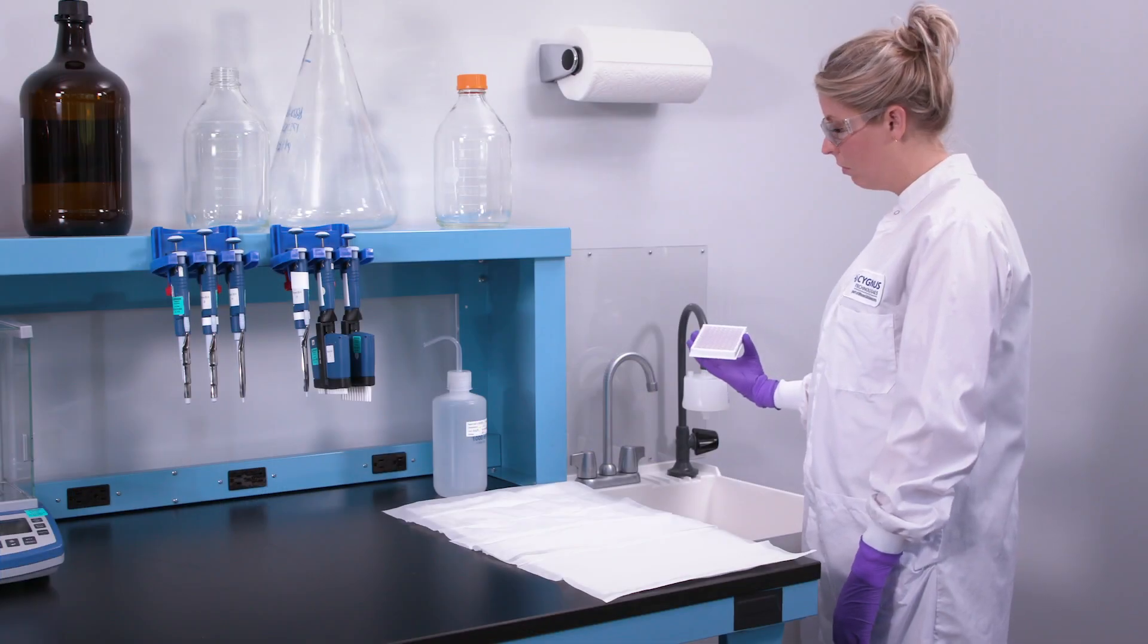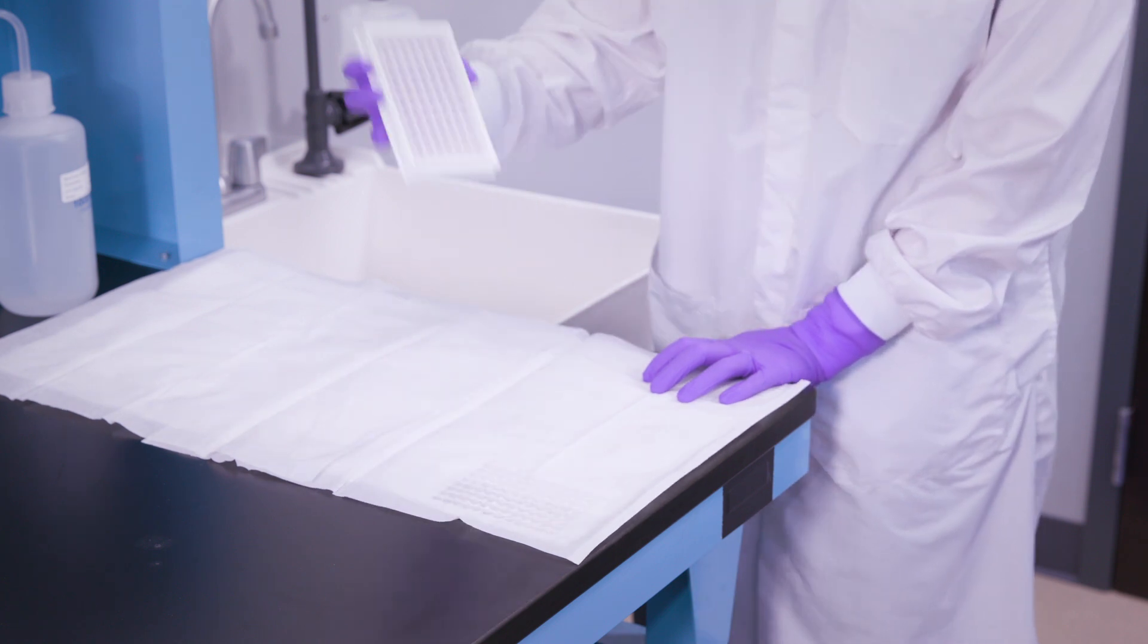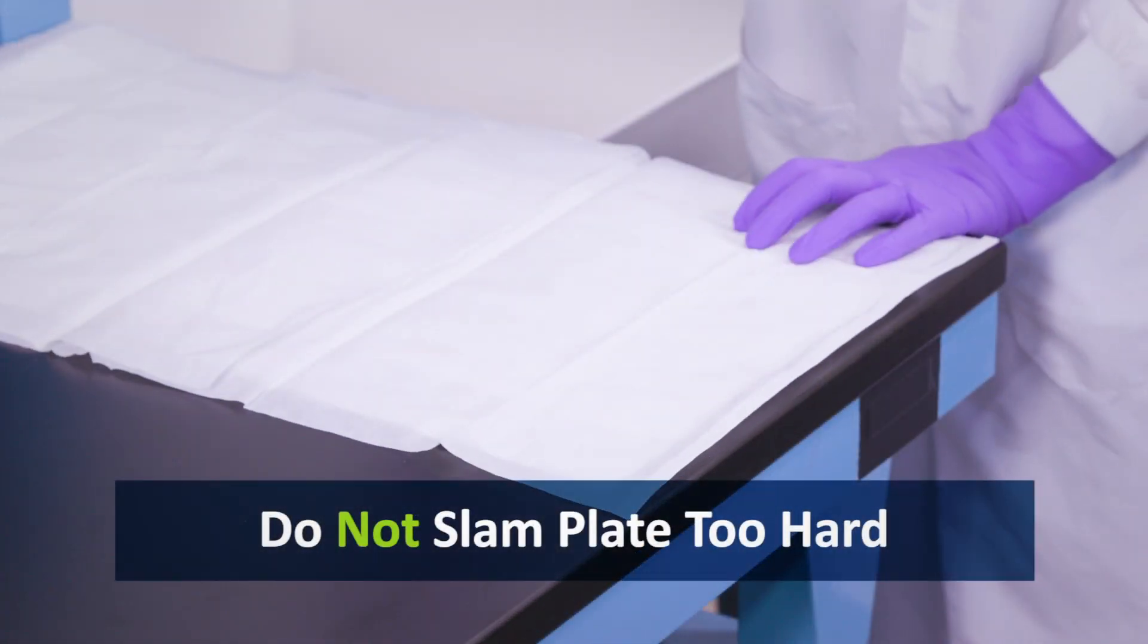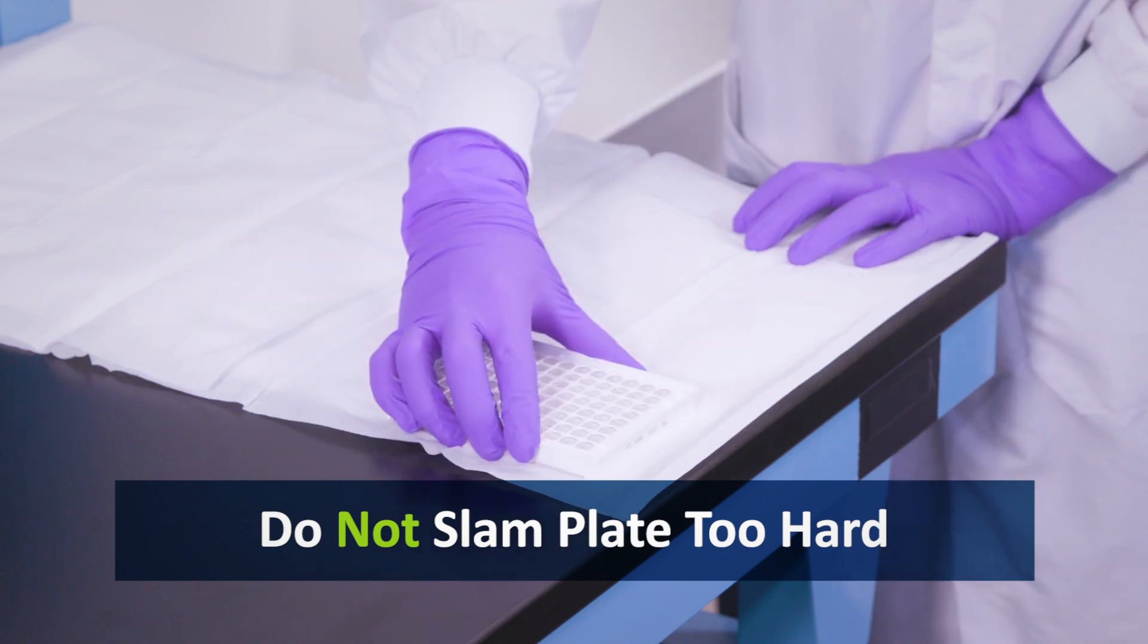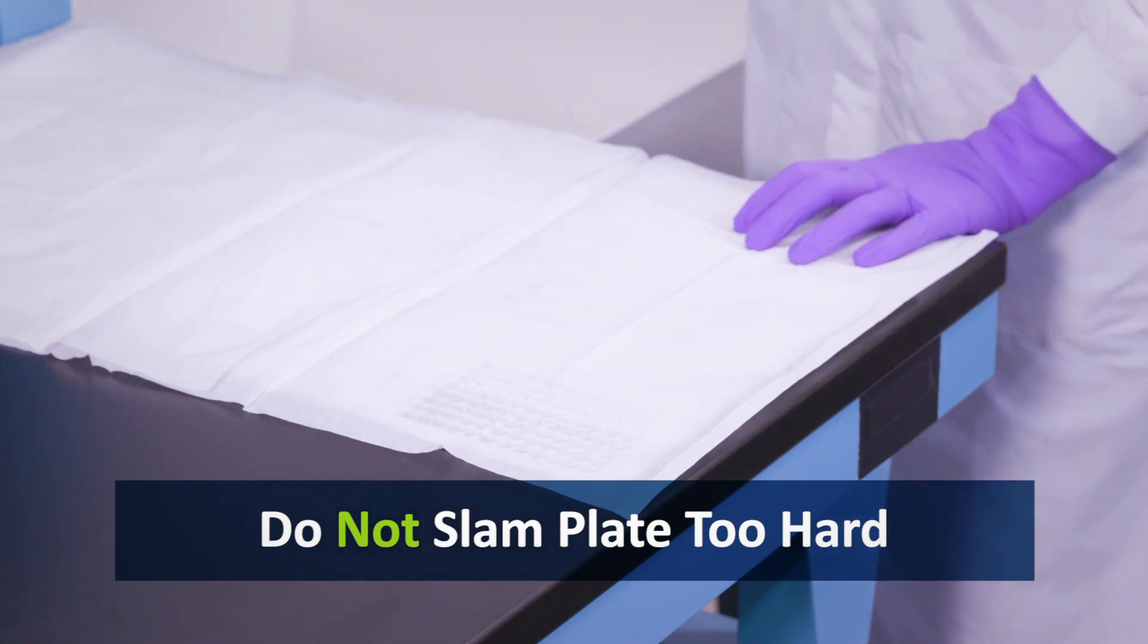Next, immediately tap the plate gently and evenly on your blotting paper once. Do not slam the plate too hard, as this may cause variable dissociation due to the transference of unequal amounts of shock energy across the plate.